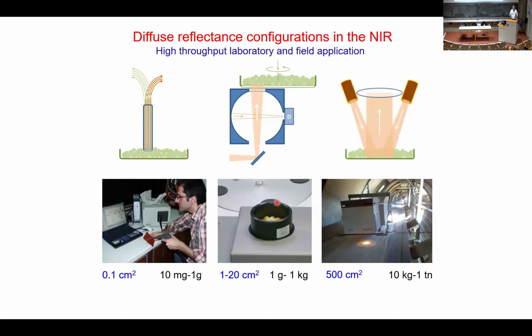Now, in the lab, you would do near-infrared in a number of ways. If you have a powder sample, you would use a powder probe. A powder probe is a bundle of optical fibers, 15, 17, something like that. Half of them are sending the light. You touch the sample or whatever object you want to measure. The reflected light is coming back from the remaining fibers and is being analyzed. The whole thing looks like the gun that this fellow is holding here, but the sample is not clay.